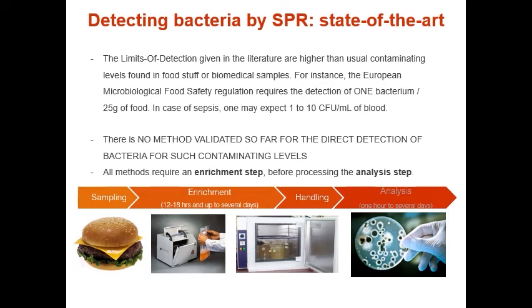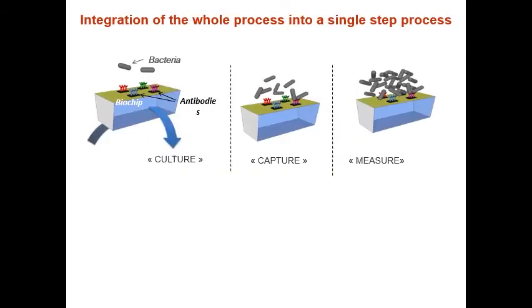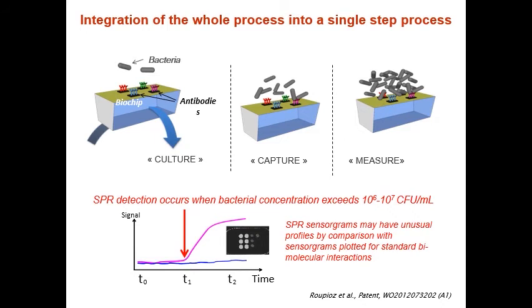Usually, the enrichment step lasts 12 to 18 hours and is followed by the analysis step lasting less than 1 hour in the case of PCR, for instance, and up to several days for cultural methods as shown here in the slide. A few years ago, we developed a method enabling us to carry out the enrichment step on the biochip itself. Samples are processed according to standard validated protocols for the enrichment step, which is carried out directly in the SPR imager. As the concentration increases and exceeds the limit of detection, the SPR response arises by comparison to control signals.